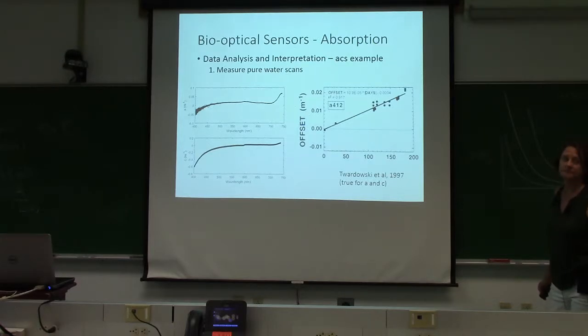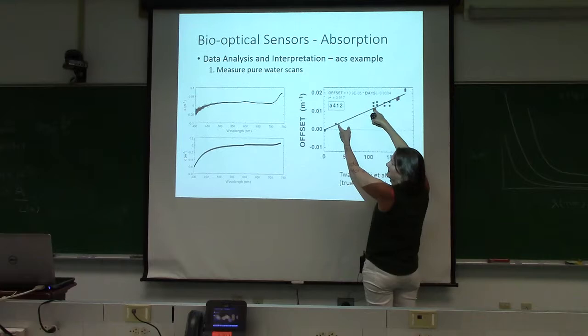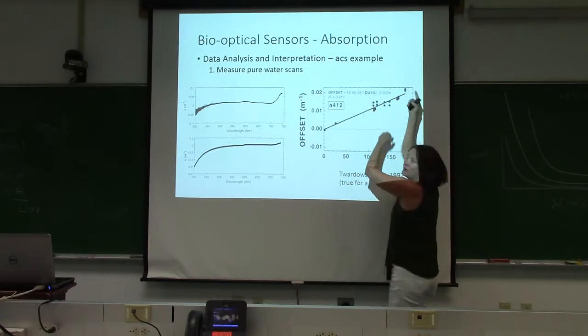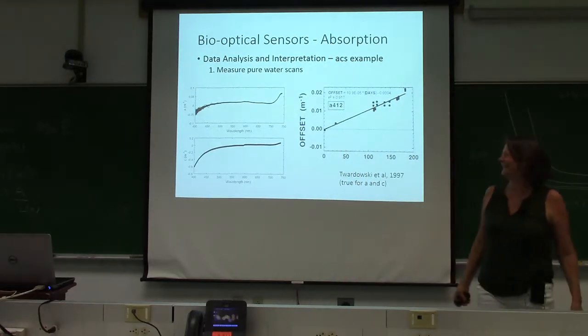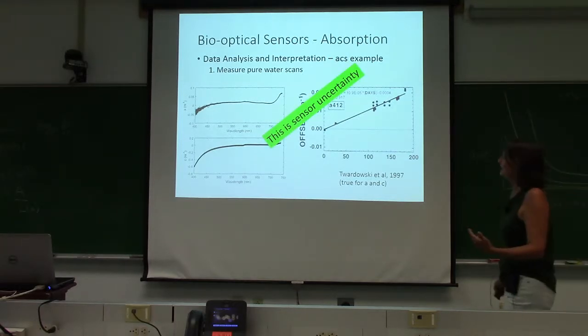And the drift happens also when it's on the shelf. So that's not only sample by data. This is the jump between the first reports. This is on the shelf. This is when he was on a cruise. That's uncertainty, and you can take care of it.